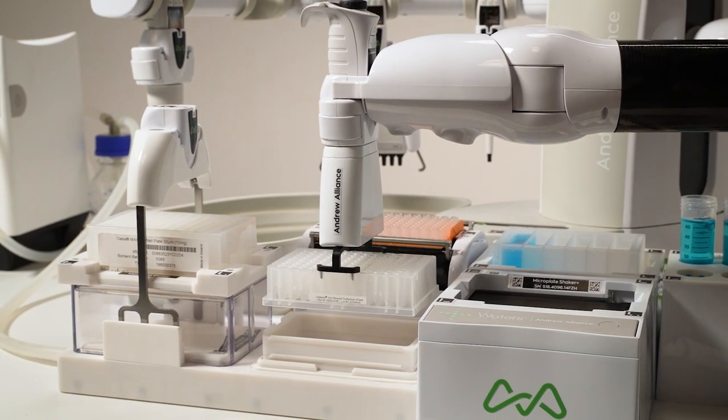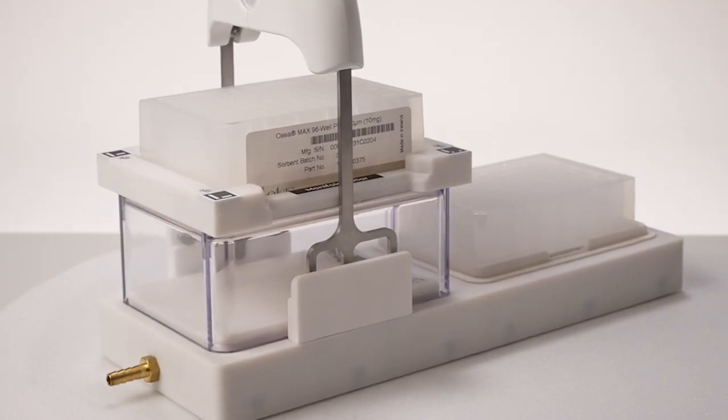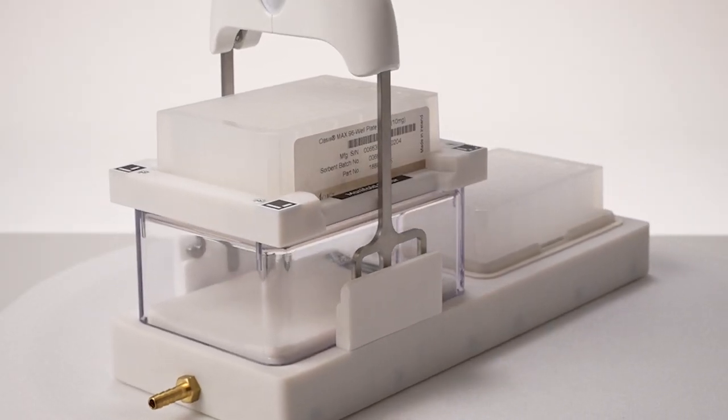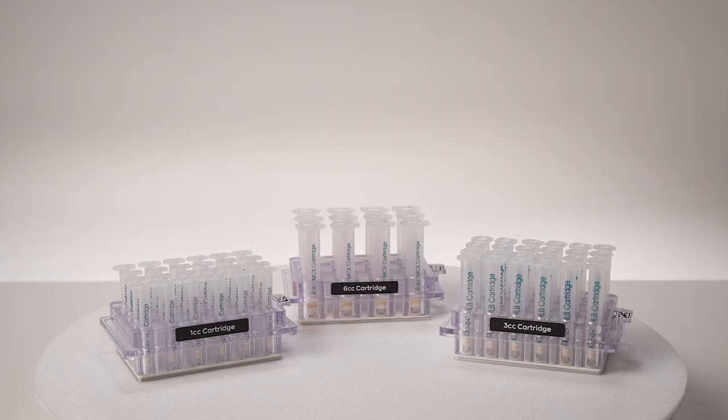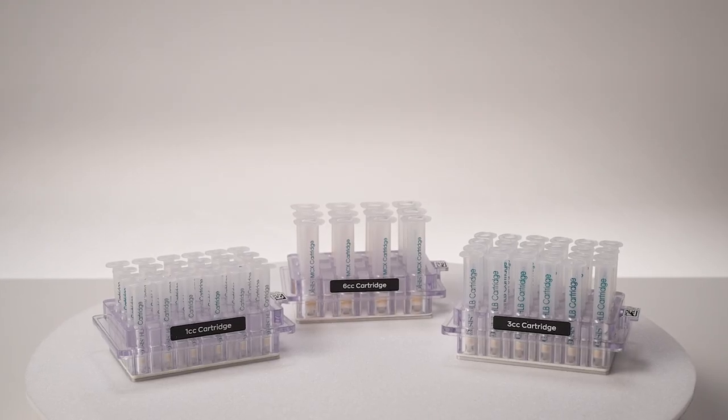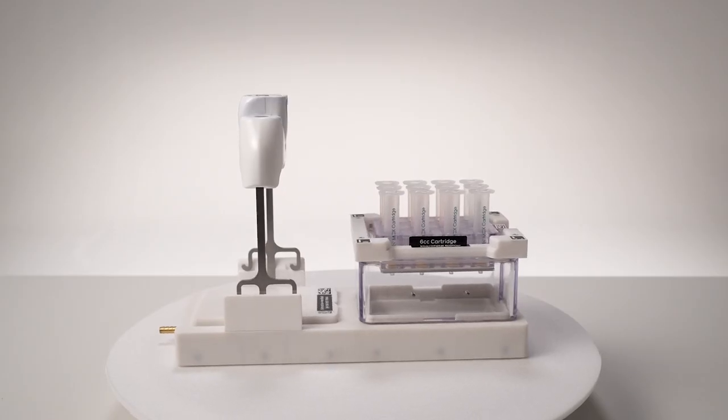Last but certainly not least, the device is capable of functioning with standard 96-well extraction plates, but also 1cc, 3cc, and 6cc cartridges. And that's just for the extraction labware.